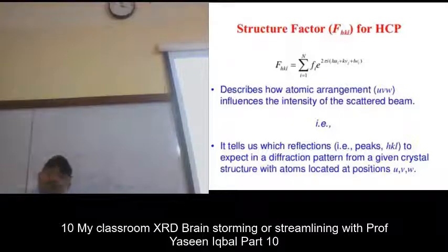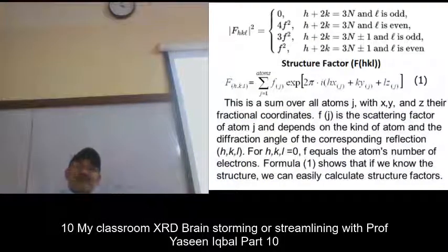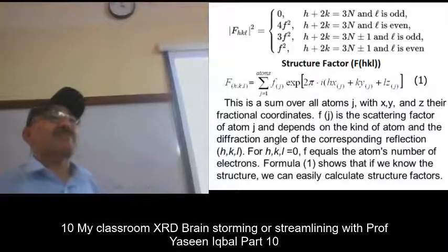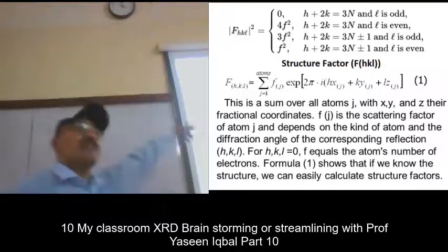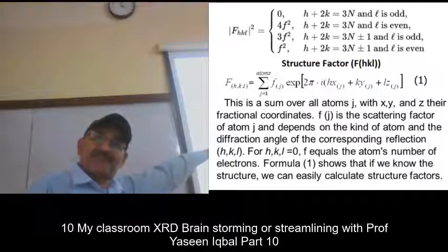And in this 11 category, how many diffraction peaks will be there? And when you reach up to 999 HKL, you will have millions of HKL indices, but that is not occurring because of the structure factor.